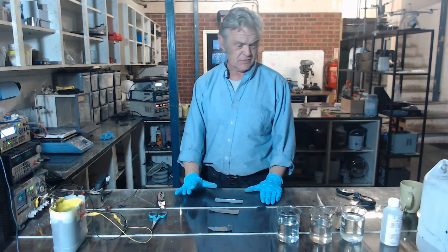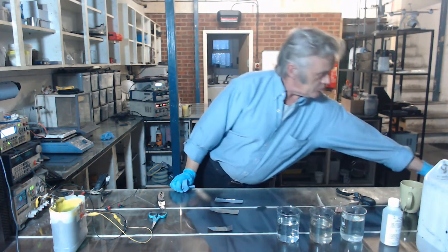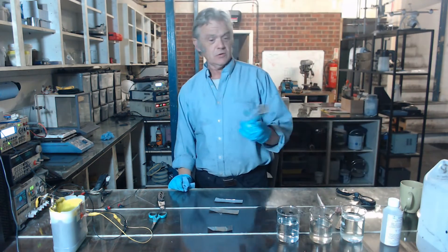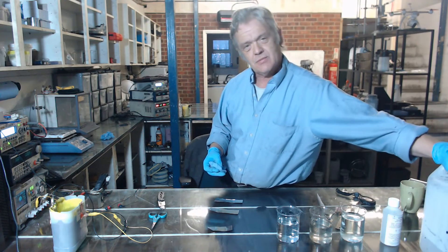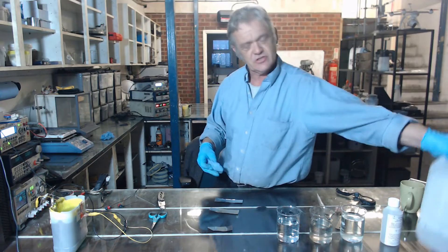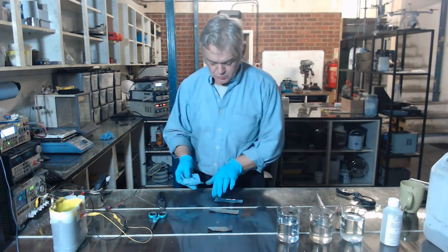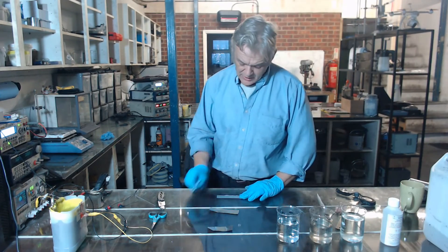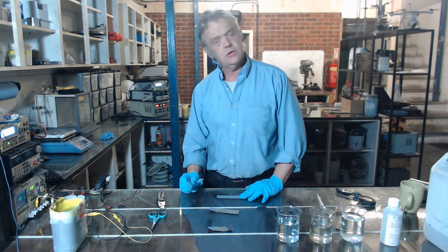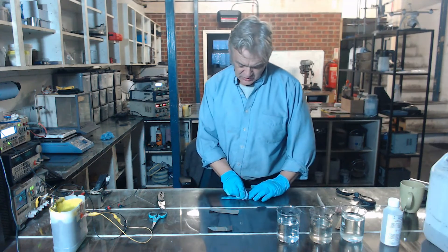If you want to passivate the surface of the aluminium, the first thing you really need to do is clean it. This is just a bit of kitchen foil taken off the roll, so it has a whole load of grease on it and various contaminants from the production and handling process. So the first thing to do is give it a wipe over with some IPA — isopropanol alcohol — or equally you could use acetone, just to clean all that dirt and grease from the surface.